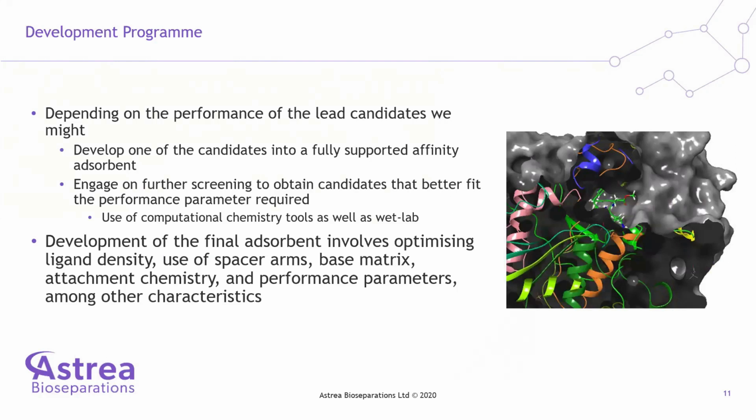expand the search for a candidate that fits better the performance parameter that is required, including using computational chemistry tools to refine or try to target better what we are trying to accomplish. And that also could involve wet lab experiments.